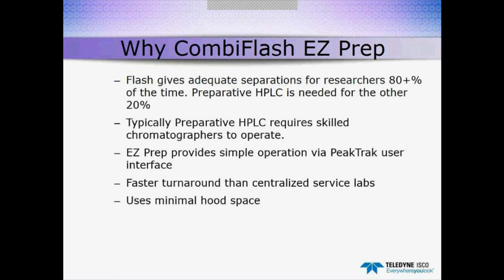The other advantage is you can get faster turnaround time. If you've got a larger corporation, a lot of the preparative HPLCs are driven by centralized service labs, and so samples have to be submitted, and so lead times on getting a purified sample can be a matter of hours to a matter of days before purified samples return back to the bench chemist for use in the next step in a sequence.